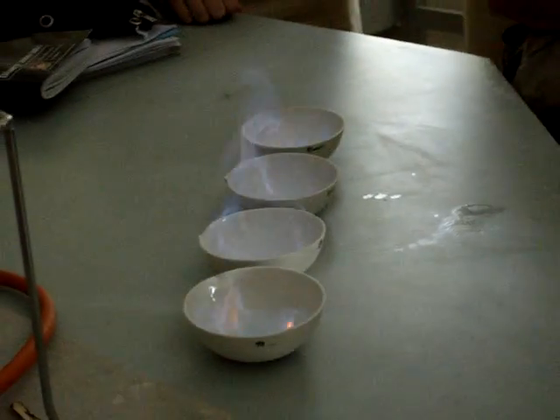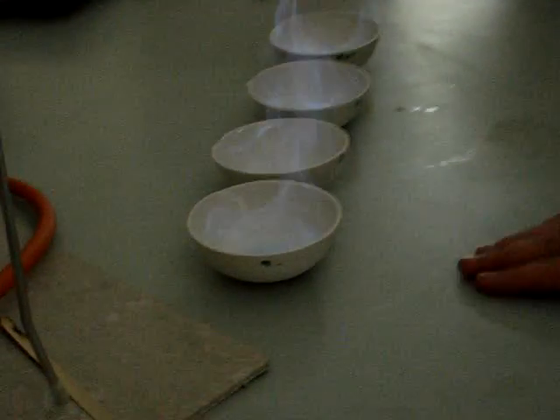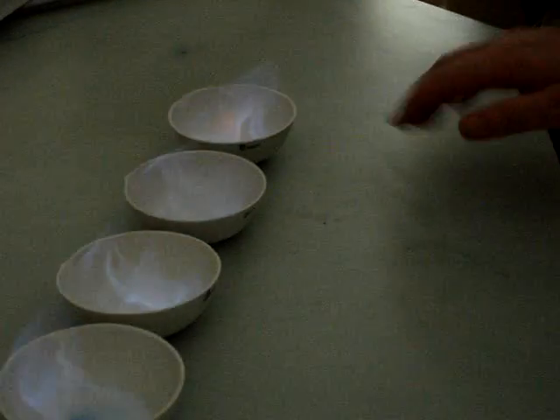As the methanol burns, what should happen is you should get different colors. Now this one should be green, red, yellow, purple. Oh, it's turning purple. I saw it. Sometimes it flickers.